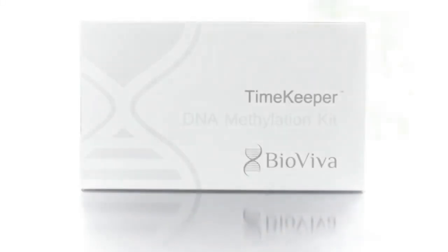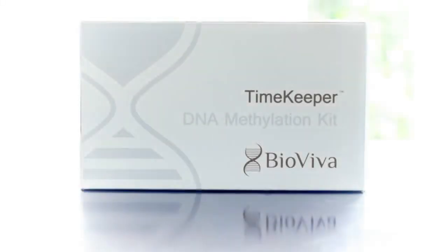Inside, there is what appears to be clear paper wrapped around the contents — the test itself. I love how these tests are getting smaller and smaller over time. If you've tried the Timekeeper, you'll know that we have very, very little waste. People are becoming more conscious about the product and the design of the packaging.